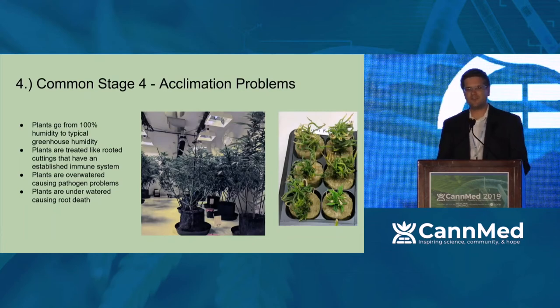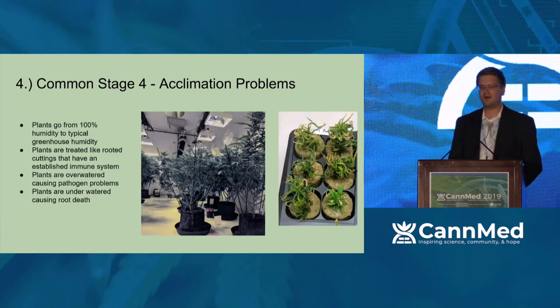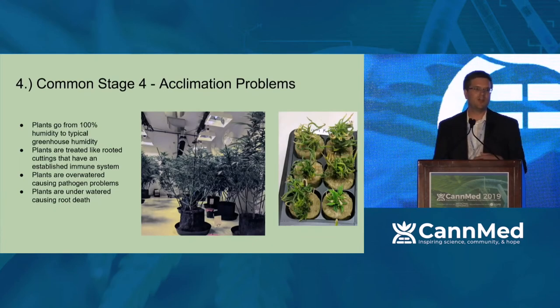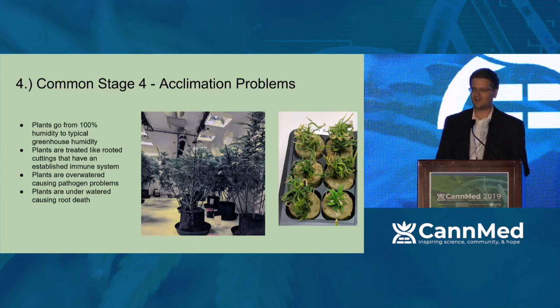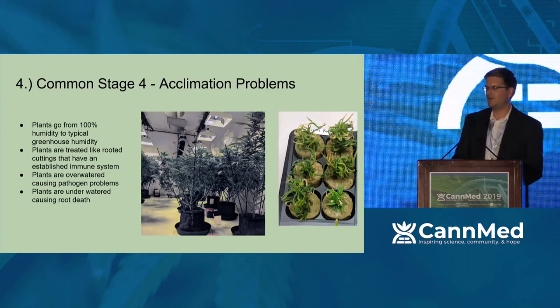The last one that I really have noticed is stage four problems, or acclimation problems, where the grower will actually pull their plant out of the test tube and just expect, well, it has shoots and it has roots, why can't I treat it like a cutting? Well, these things have been under 100% humidity. There's no reason that you should expect to treat that like a cutting. You have to harden it off, treat it like a non-rooted cutting maybe, but not one that you can just plop out of a tube and stick straight in a greenhouse.